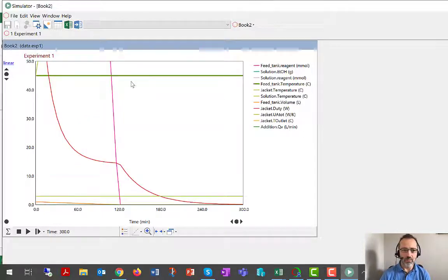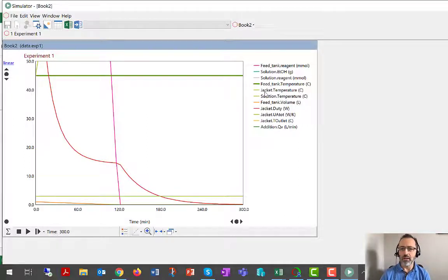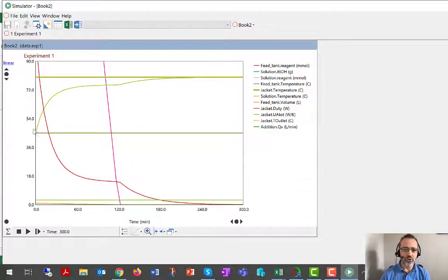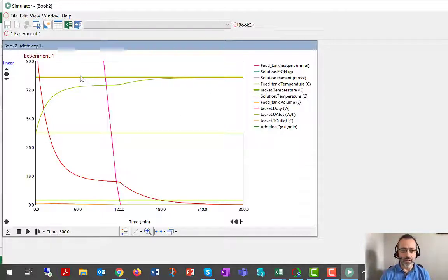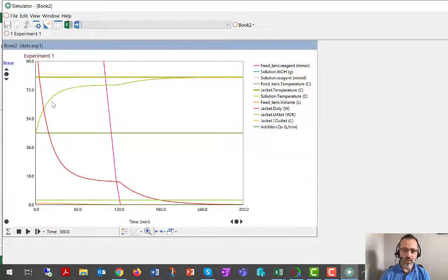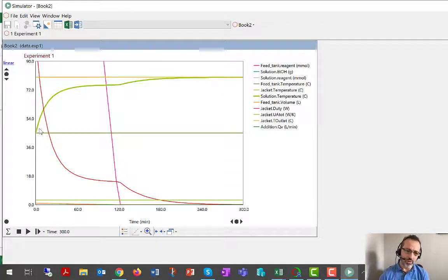Feed tank temperature is, as would be typical, 20 degrees C. Jacket temperature is 80 degrees, as we defined earlier.